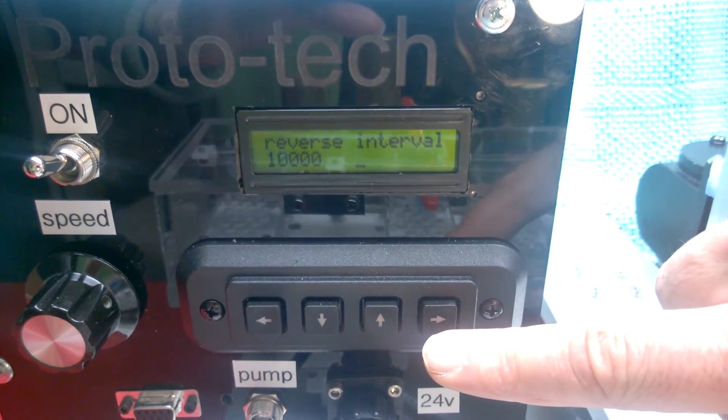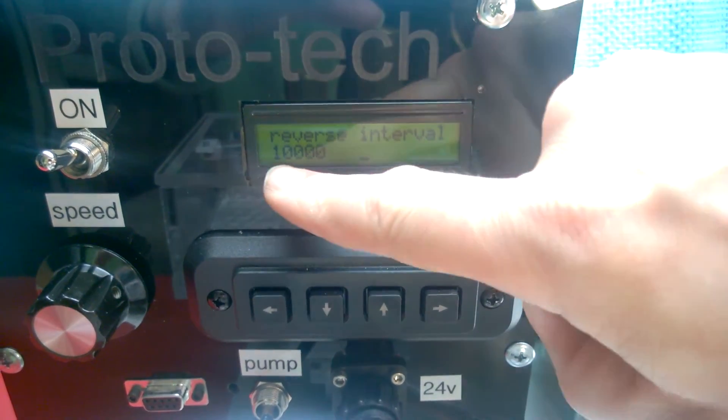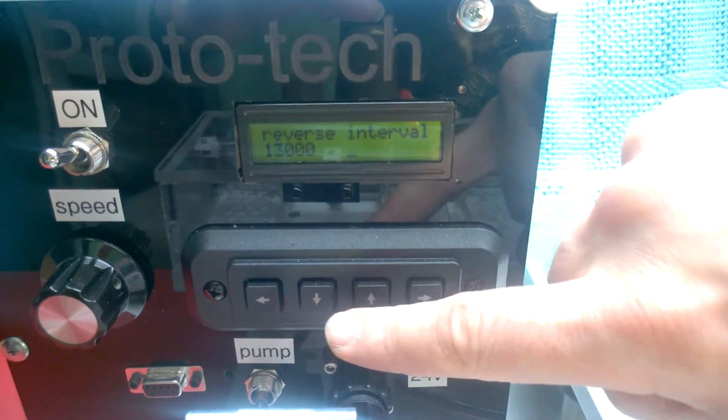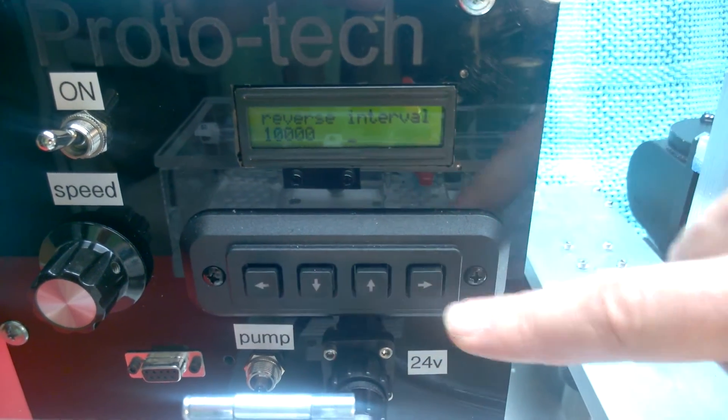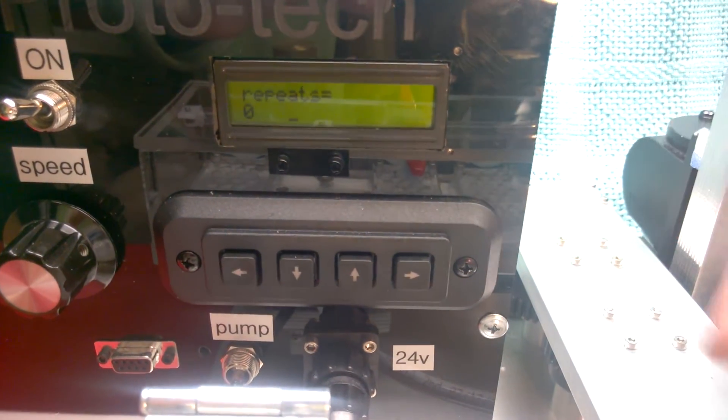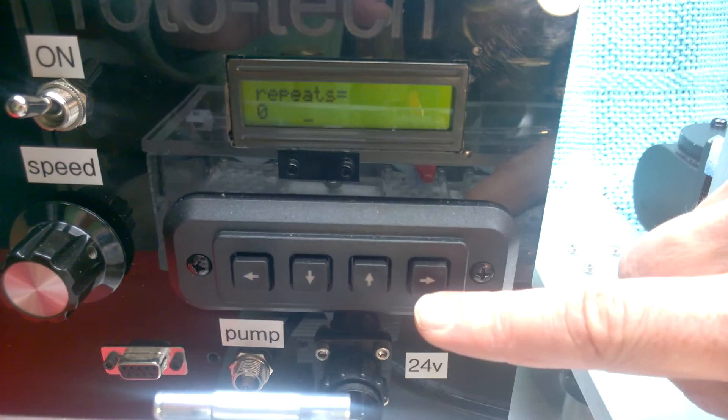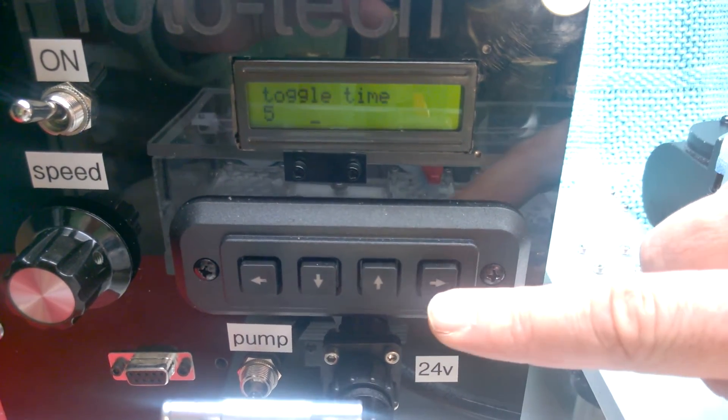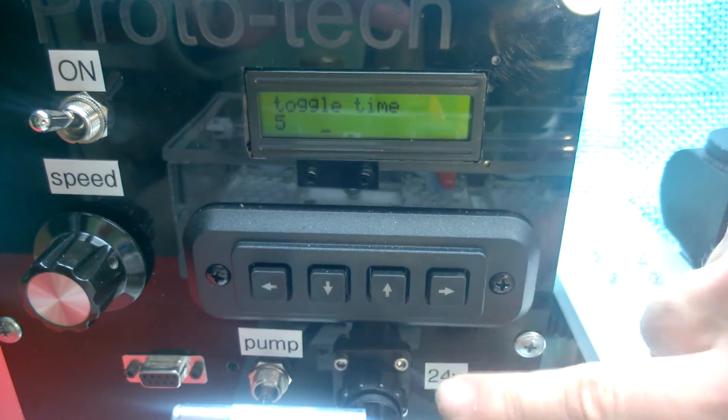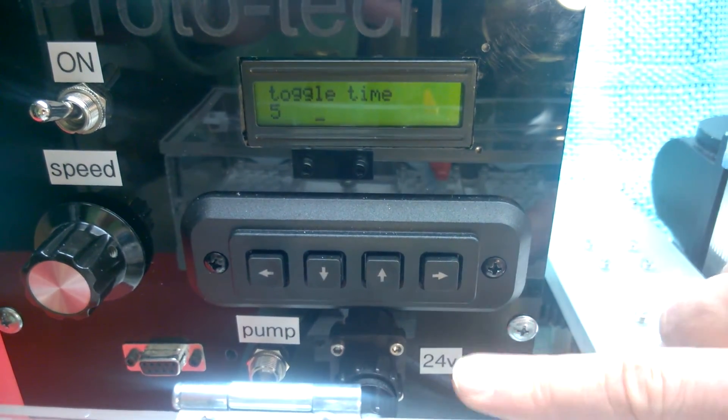And how often it changes direction. Every 10,000 cycles or 12, 11, 10, enter that. Number of repeats. That's the number of times it starts over. So you can go to very high numbers of cycles. And also, this is controlling the amount of time for this 24 volt output, which is an option.